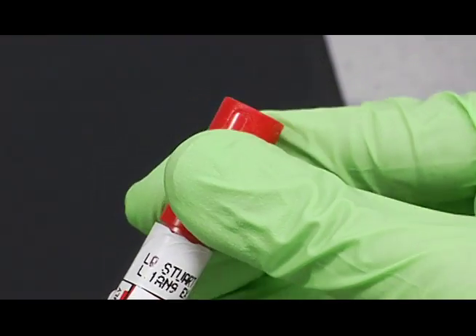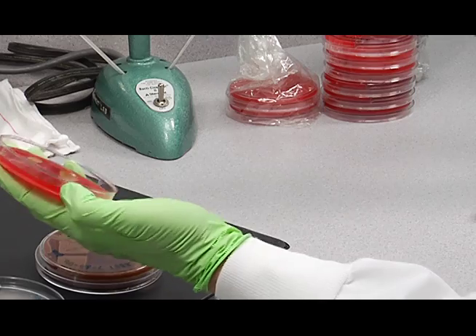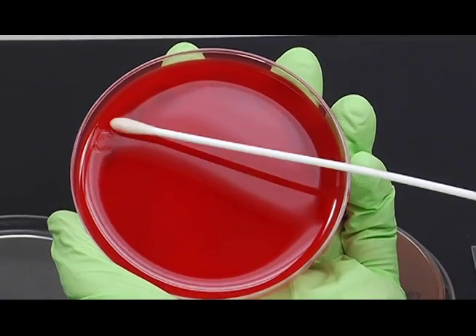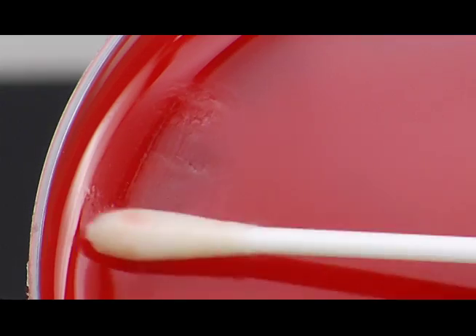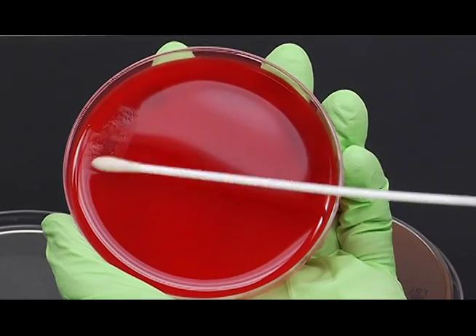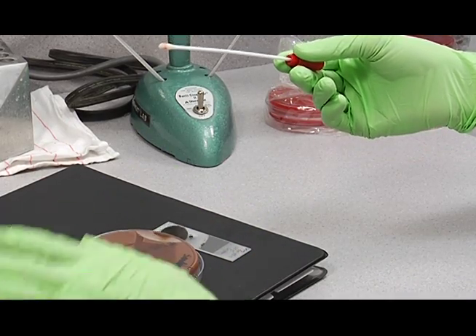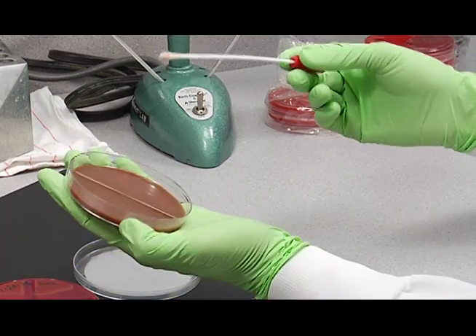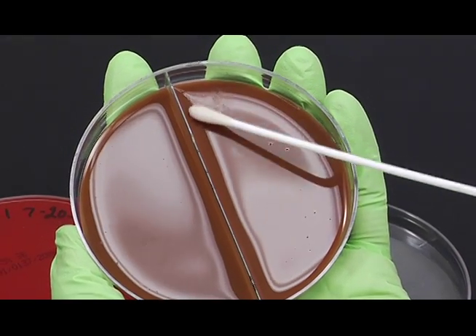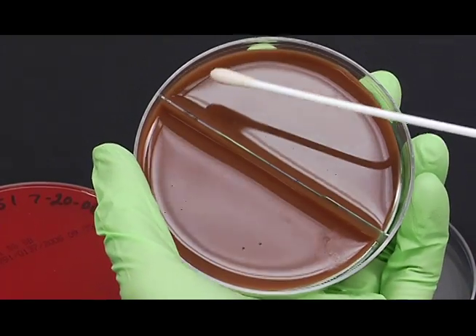Take the swab out of the holder like this. Then inoculate your plates. Hold the plates like this, and you want to make a nickel-sized area of inoculum, rolling the swab as you do that. Then do the same with the rest of the media — the chocolate side and the Martin Lewis side.